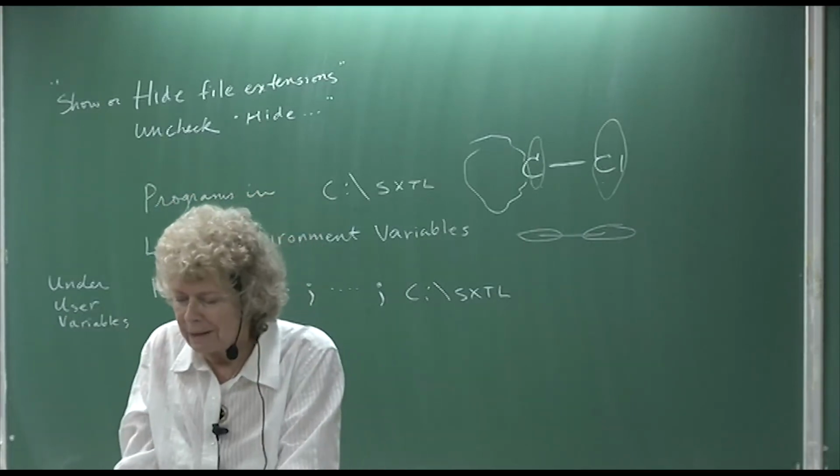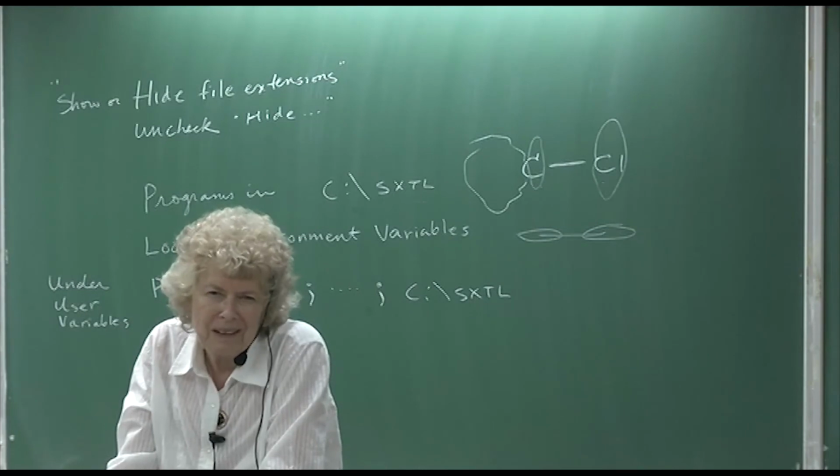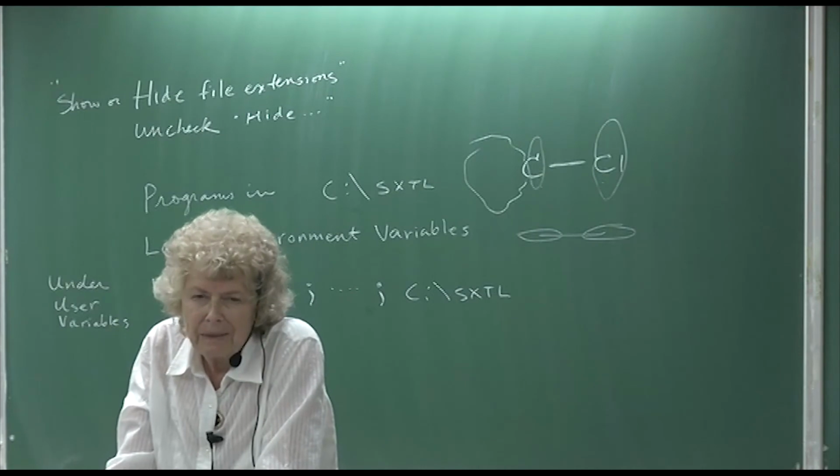So the bad Hirschfeld thing is often just because you have a heavy metal, silver, gold, mercury, or bromine. It's just electron density around the atom that's causing it. It's not real.